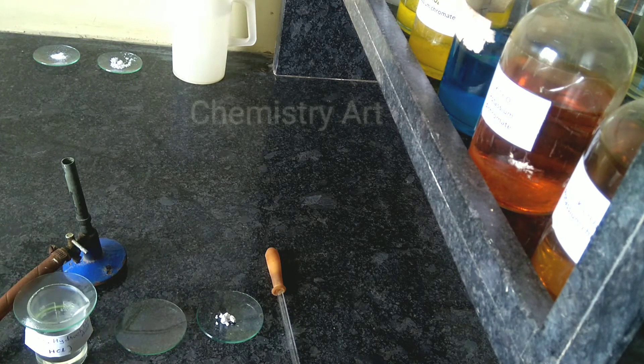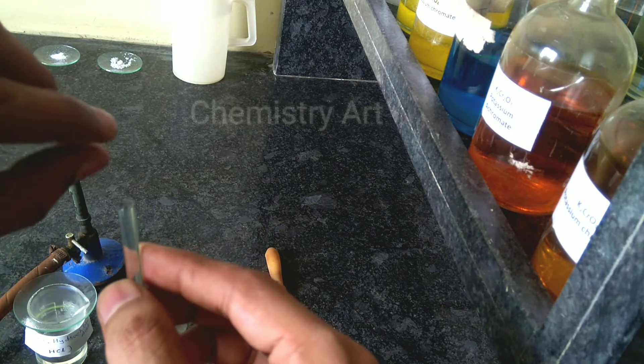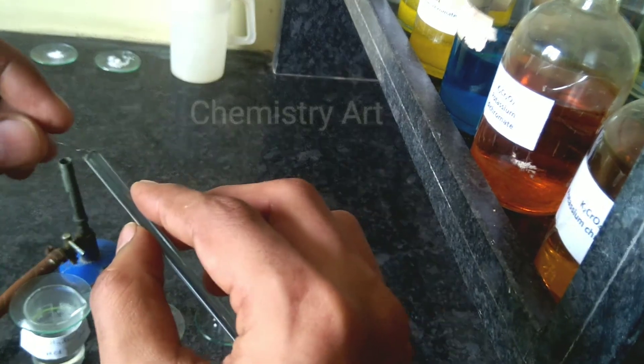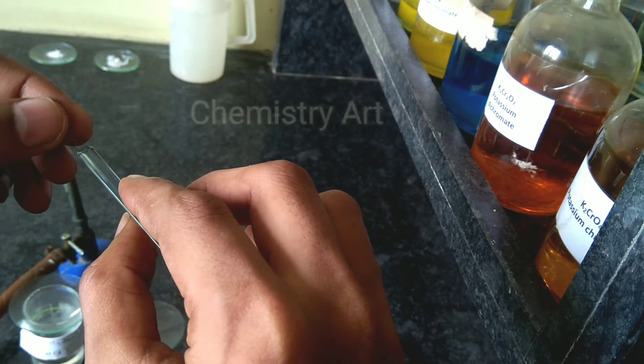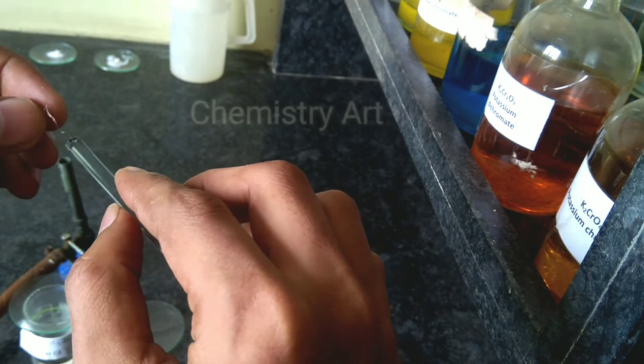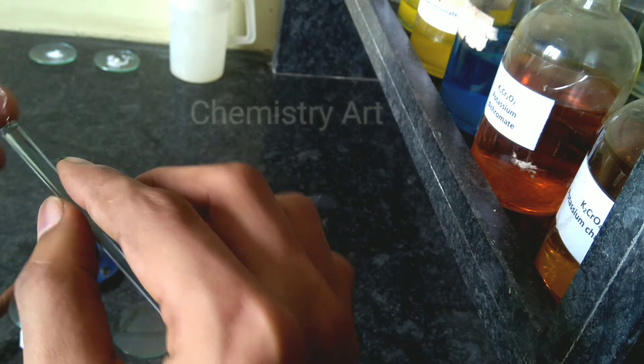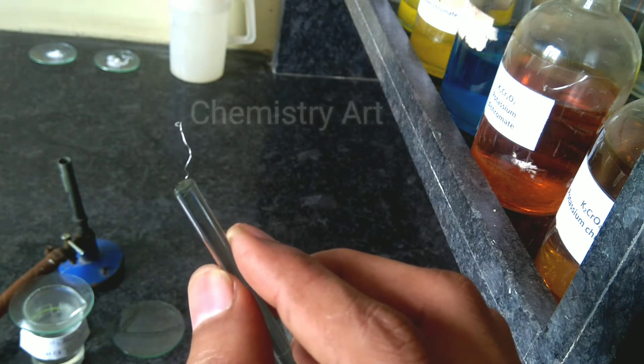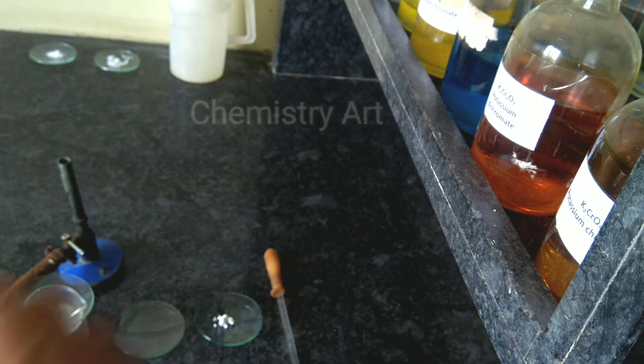You have to make a small loop on the end of the platinum wire so that you can take the mixture of hydrochloric acid and salt in it, and then that loop we have to heat in the oxidizing flame of the burner. Here you can see the loop is prepared.